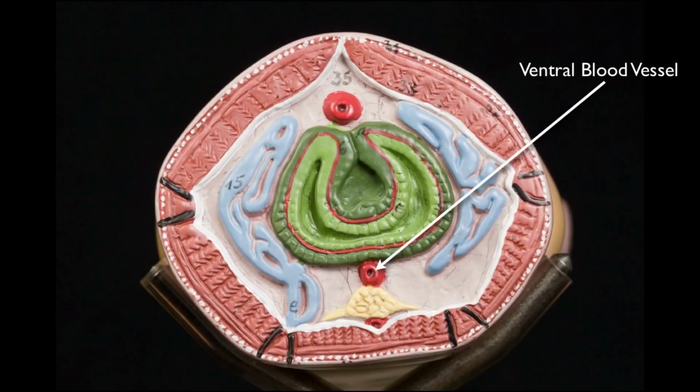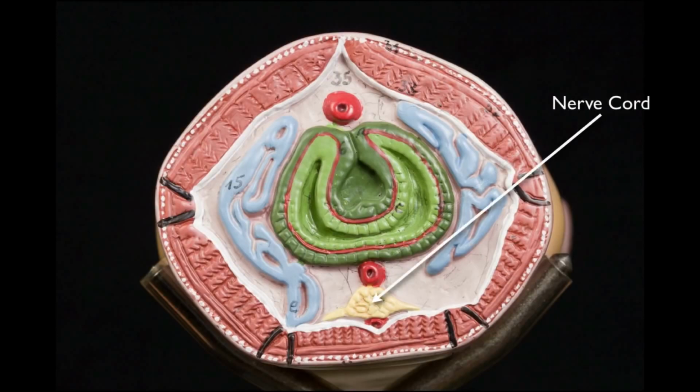Beneath the intestine is the ventral blood vessel. This vessel carries blood away from the hearts, and therefore is equivalent to an artery in vertebrates. The dorsal blood vessel takes blood back to the hearts and is equivalent to a vein. Beneath the ventral blood vessel is the nerve cord. Like most invertebrates that have a central nervous system, the nerve cord in annelids is located in the ventral part of the body. As we will see in the Invertebrates 3 lab exercise, chordates are the only major phylum with a dorsally located nerve cord.